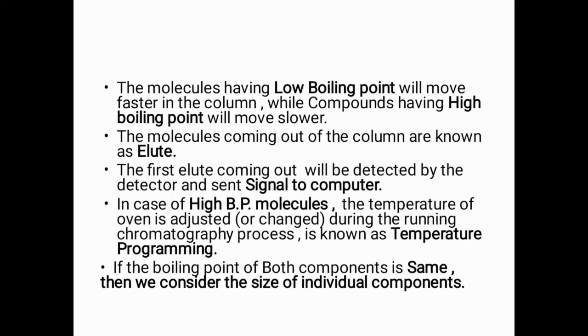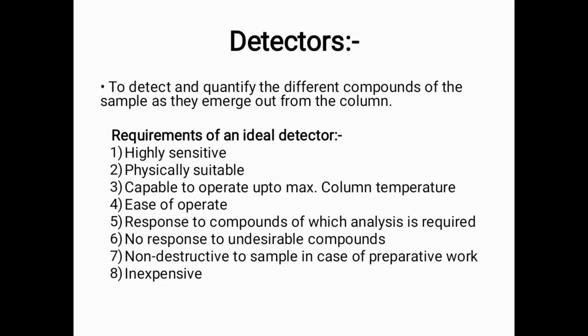If the boiling point of both the components is the same, then we consider the size of the individual components. The smaller molecules move faster and the larger molecules will move slower. Talking about the detectors of gas chromatography, the detector is used to detect and quantify the different components of the sample as they emerge out from the column.